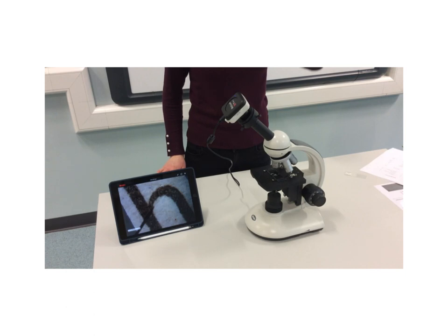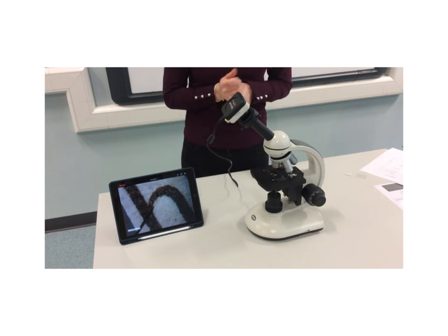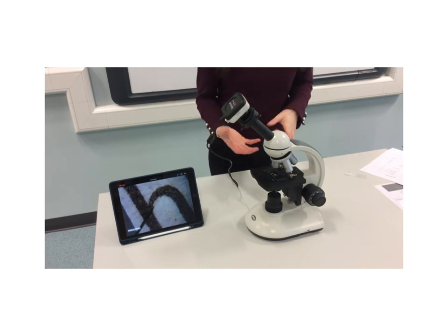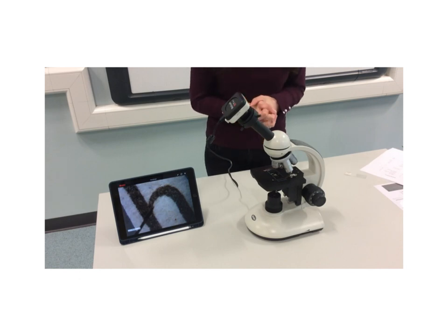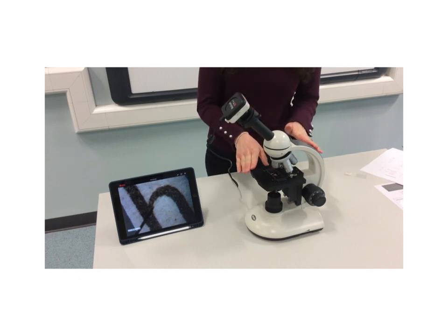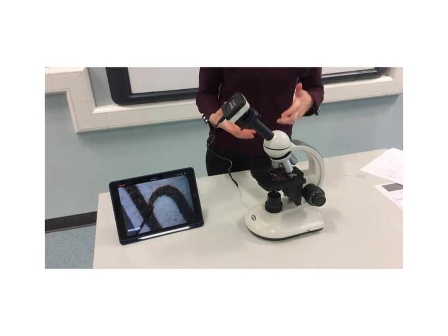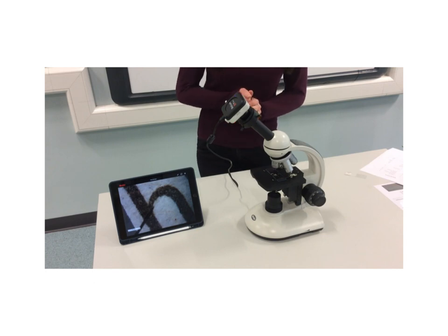So First Form, in this video what we want to do is to recap on our microscope, the different parts, and how we use it to view an image of something maybe very small that we want to see in greater detail. So we've got our microscope here, and I want you to spend a little bit of time learning the different parts of the microscope. That's really important. So we'll recap those very, very quickly.